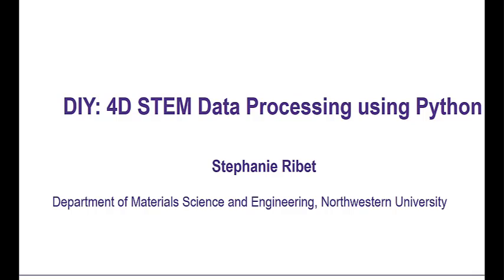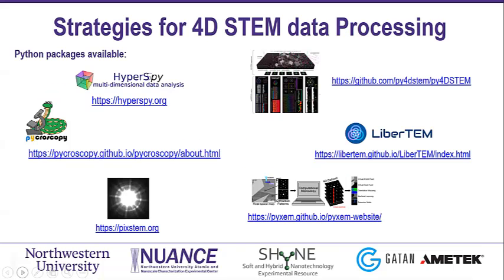I want to give a brief introduction about different strategies for STEM data processing. As I mentioned in the beginning, with the usage of 4D STEM or scanning diffraction growing in different groups around the world, there are many packages available these days. Some of them are highlighted here. I believe they are all based on Python.